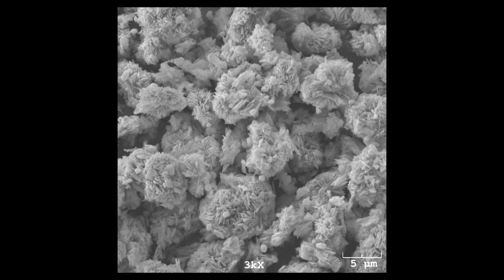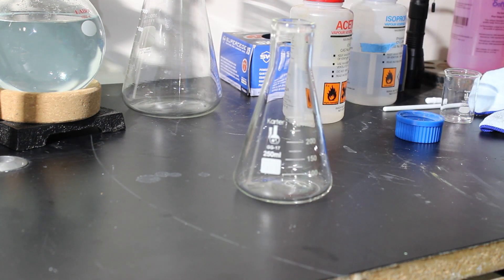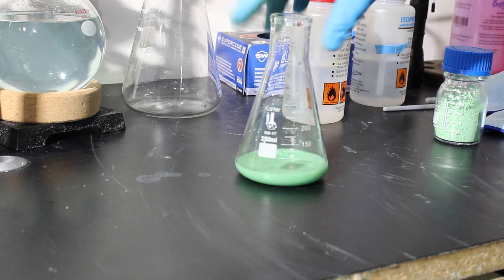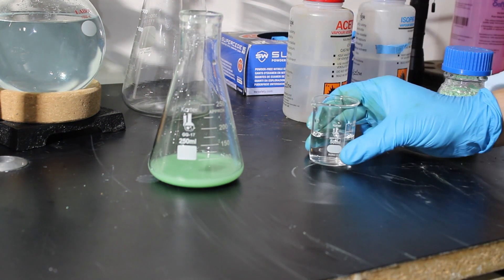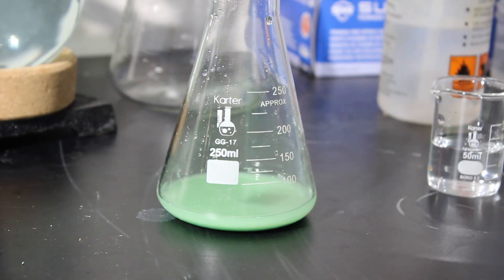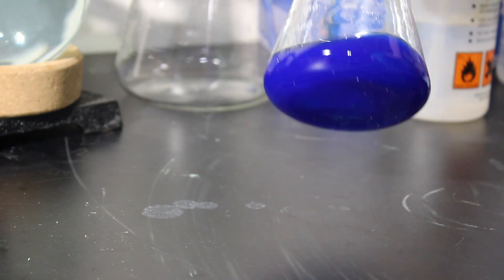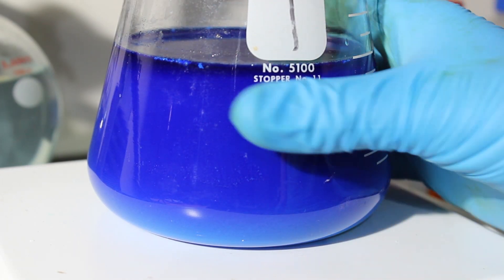I decided to do a little test: if it was a sulfate reasonably similar to copper sulfate, putting it in aqueous solution and adding ammonia should convert it to a copper complex. I have some cleaning ammonia — maybe 10% — and adding it to the solution, it turns into the nice blue complex you'd expect from copper sulfate and ammonia, which at least told me something.